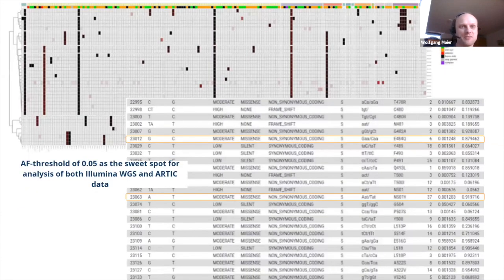Okay, so this is the reporting, which I just wanted to focus a little bit on. So if you decide not to do just the consensus sequence, but really look at everything that's there, this is the kind of output you're getting. In the back, you're seeing this colorful plot, which shows all the samples in the analysis on the y-axis, and genomic positions on the x-axis.